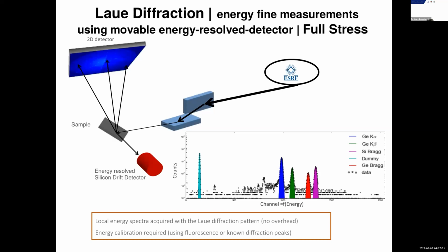So if we put a protein on BM32 in transmission geometry, where the Laue pattern is not suffering from the disorder, then due to the large spectral band of our beamline, I think we would measure too large a number of reflections. It will be full of spots, and then it will be difficult to extract information from that.